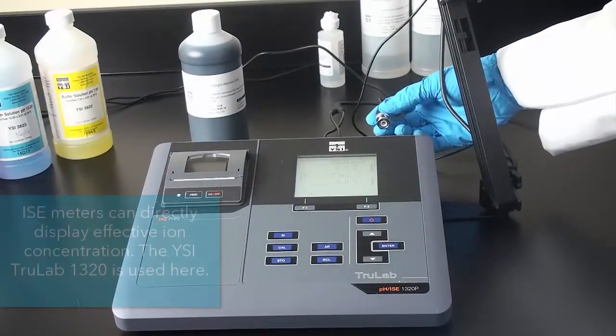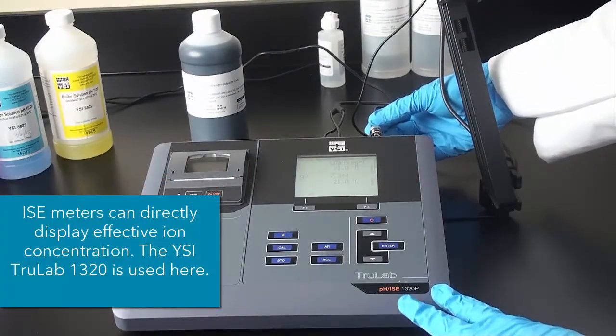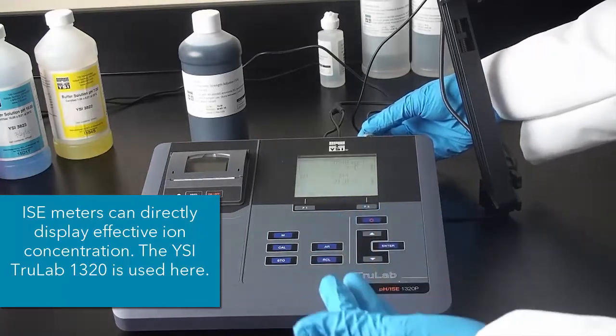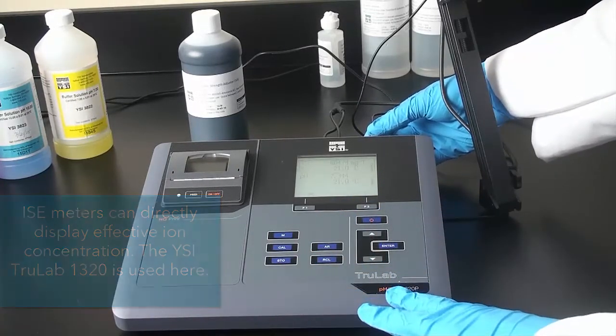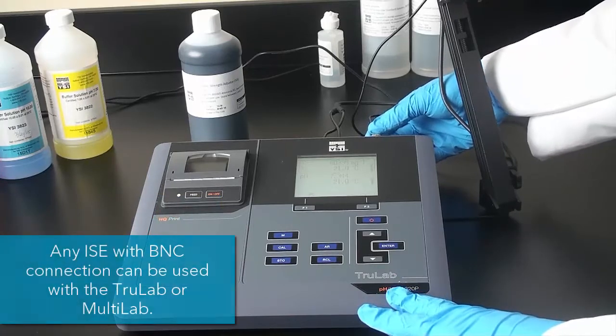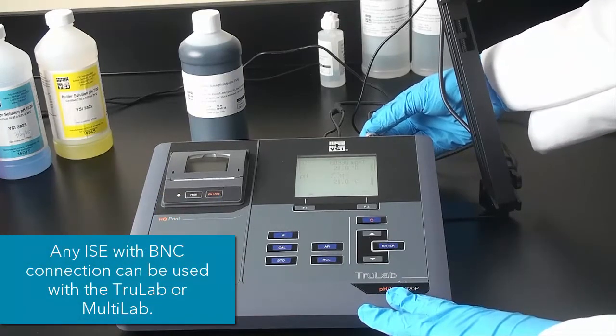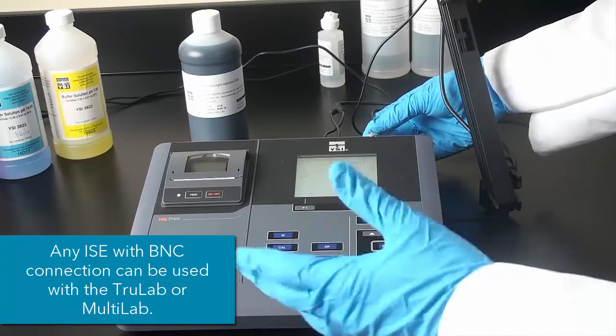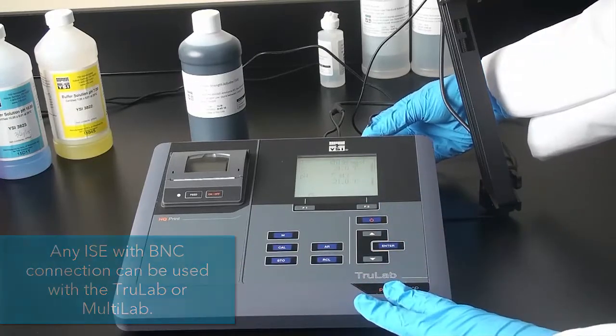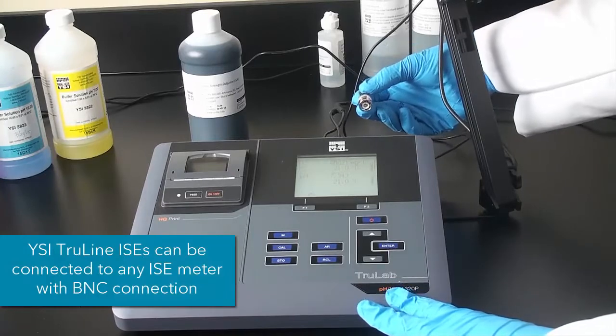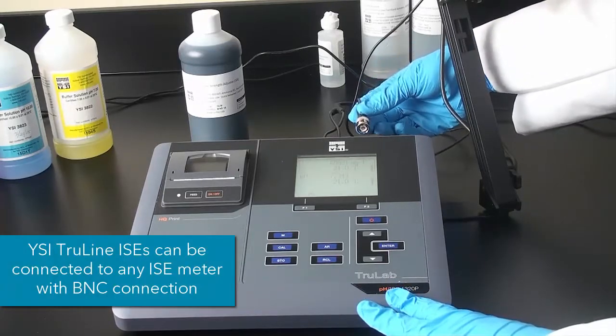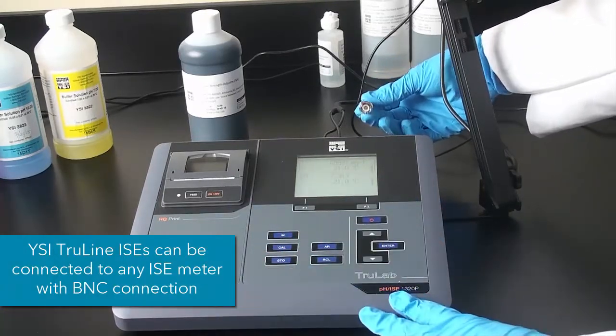So to calibrate the electrode, the first thing you will do is connect it to an instrument that can actually display ammonia concentration. So our TrueLab 1320 instrument and our MultiLab 2 and 3 channel instruments can measure ion concentration or effective ion concentration. You can connect this electrode to any other meter that does feature BNC connections, so other manufacturers' meters can also be used.